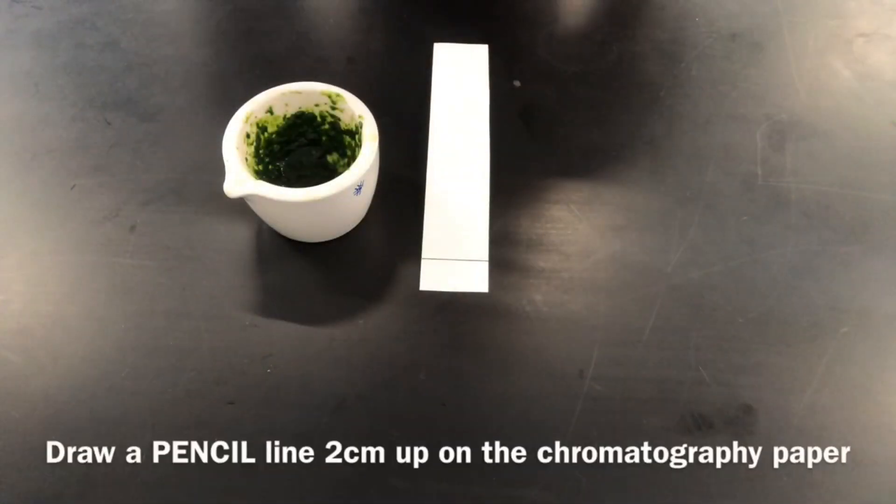After you've done this, you need to prepare your chromatography paper. This works best with thin layer chromatography paper, but you can also use regular chromatography paper. Obtain a pencil — it is important that it's a pencil and not a pen, because a pen contains other pigments. Use the pencil to draw a line on the chromatography paper about two centimeters up from the bottom of the paper, as you can see here.